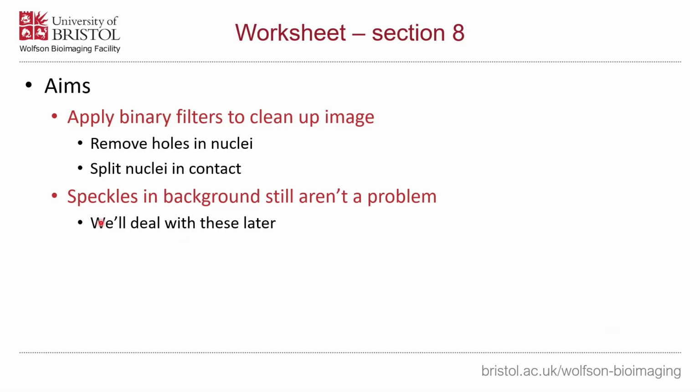Don't worry at this point if we still end up with a few small speckly objects in the background. The reason we took that size filter or the size measurement for the nuclei earlier was so that we can get rid of those at the Analyze Particles stage.